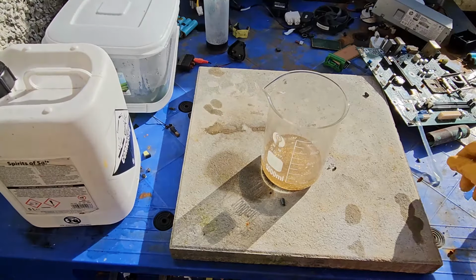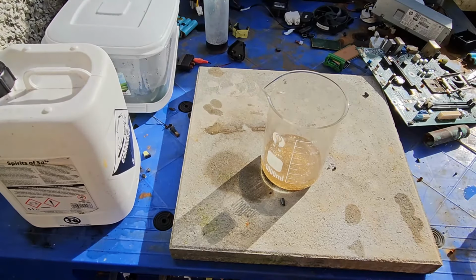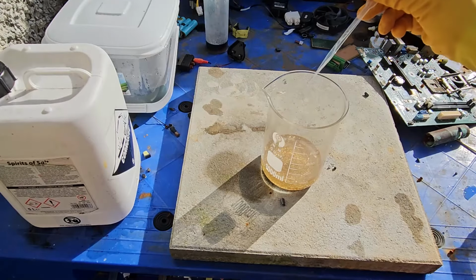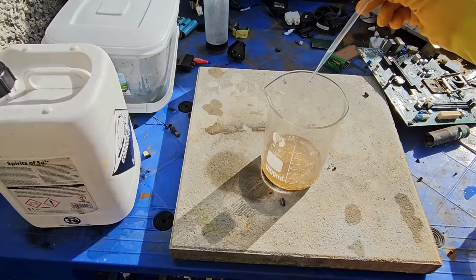And all I'm going to do is add a few mils of the bleach to the solution. I'm not going to saturate it or do too much, because again, it's only 1 gram.